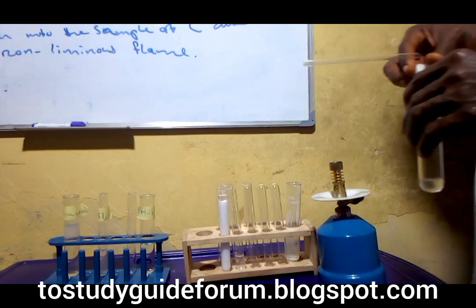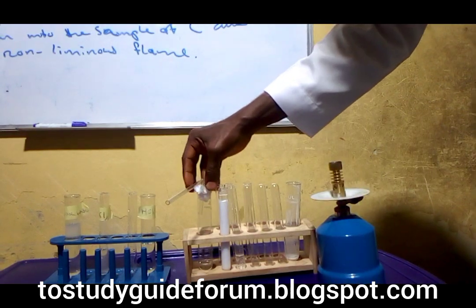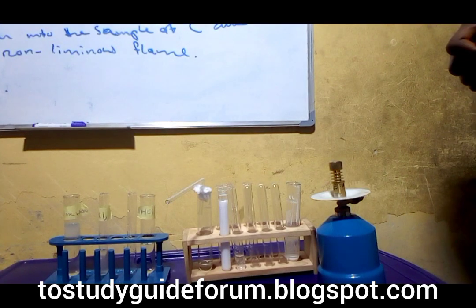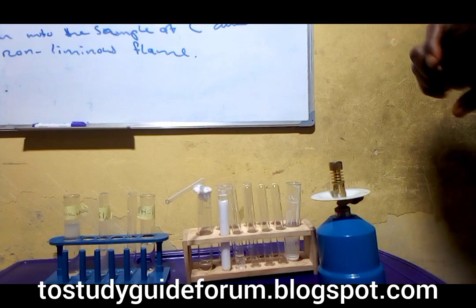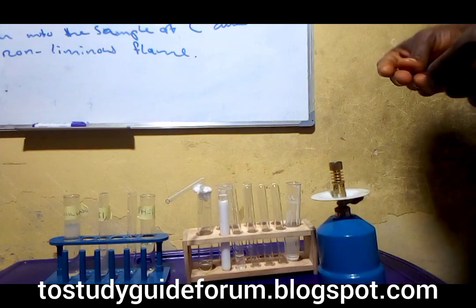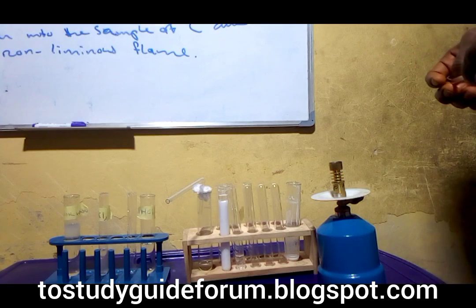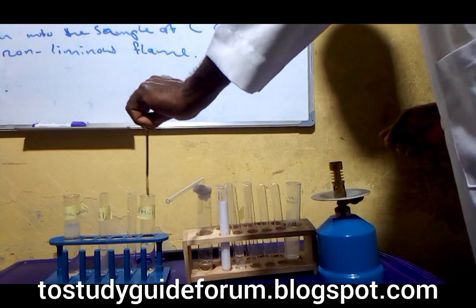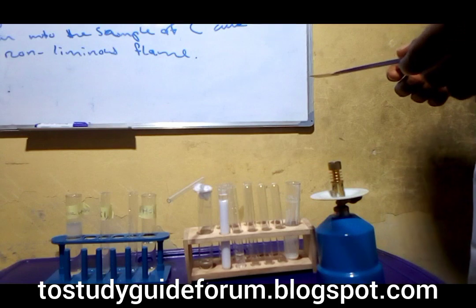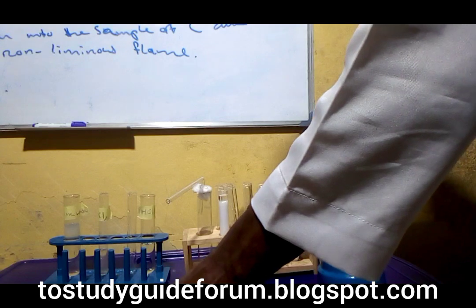So the next one we're going to do is, now that we have done the bubbling into lime water, dip a glass rod or platinum wire into hydrochloric acid, then into the sample of C, and heat. So that means we are going to use the flame now.